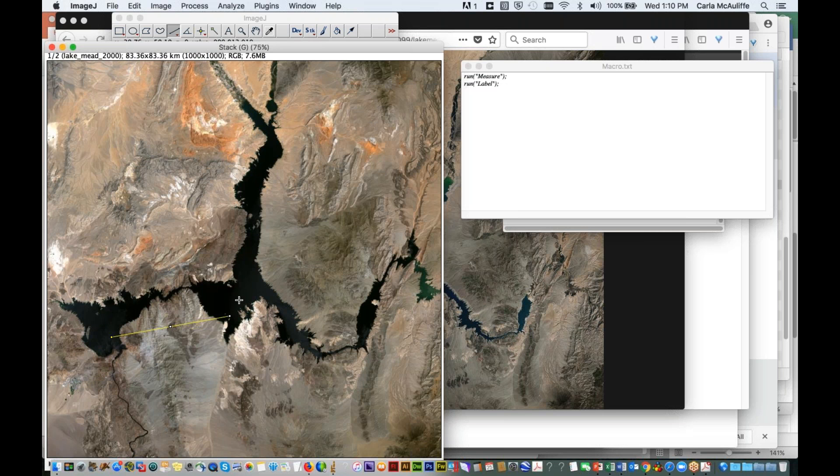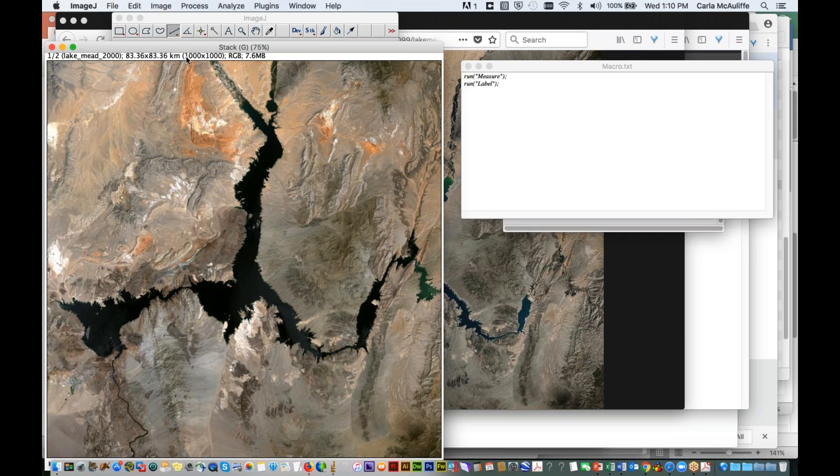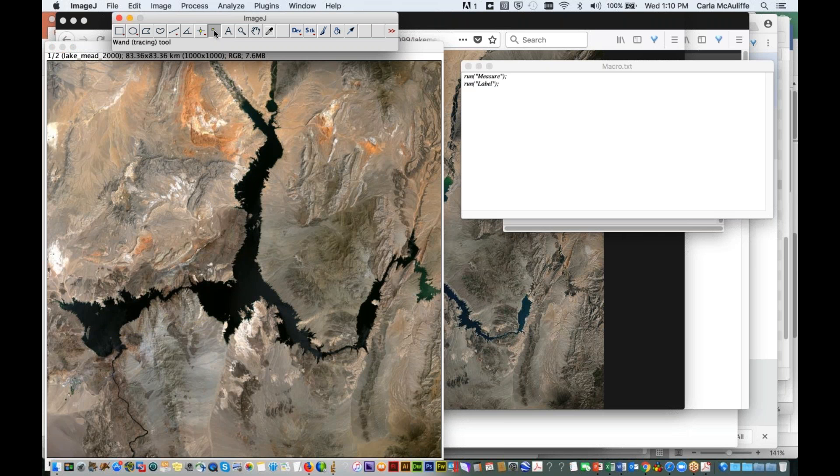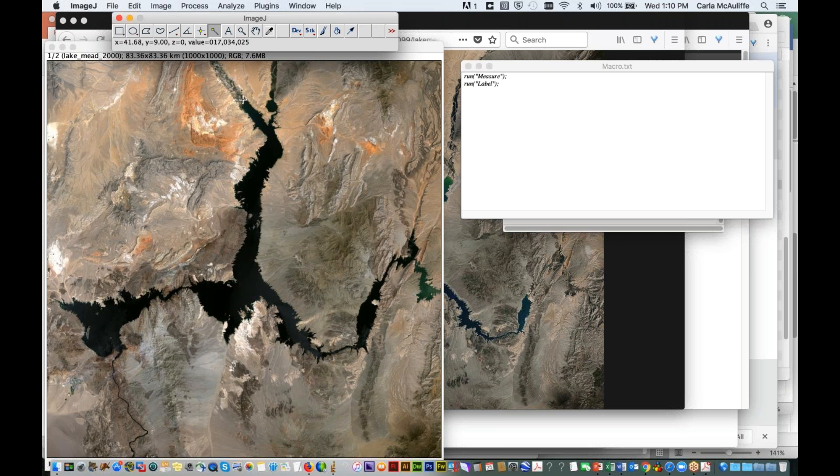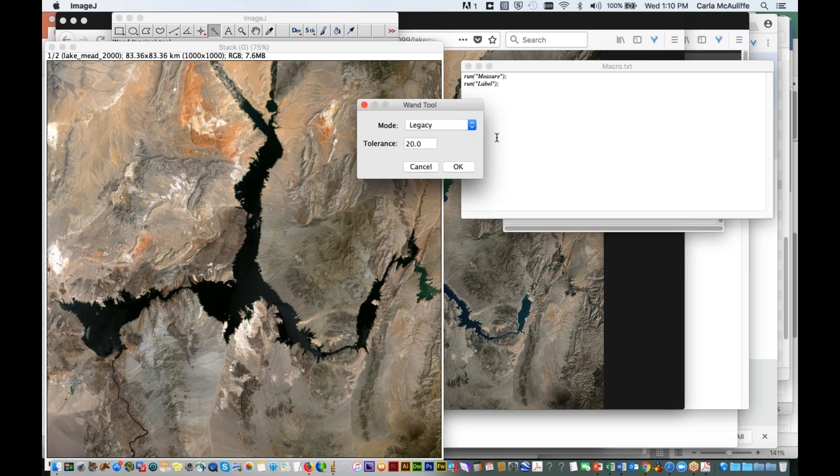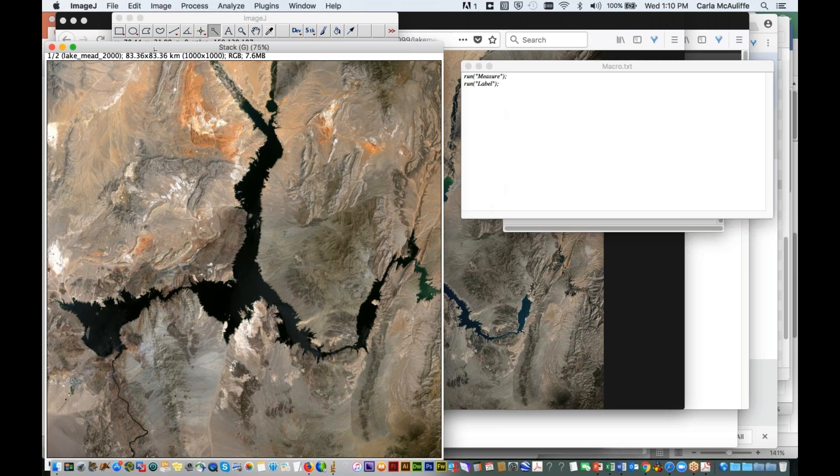So what we're going to do now is, since we've set a scale on the image, any measurements we make will be in kilometers and in square kilometers. And we're going to measure the area. To do that, we're going to use this little wand tool. And what the wand tool is going to do is it's going to pick up a range of pixel values within the feature that you want to measure. And since this is all dark, it should be fairly easy for us to measure this using the wand tool.